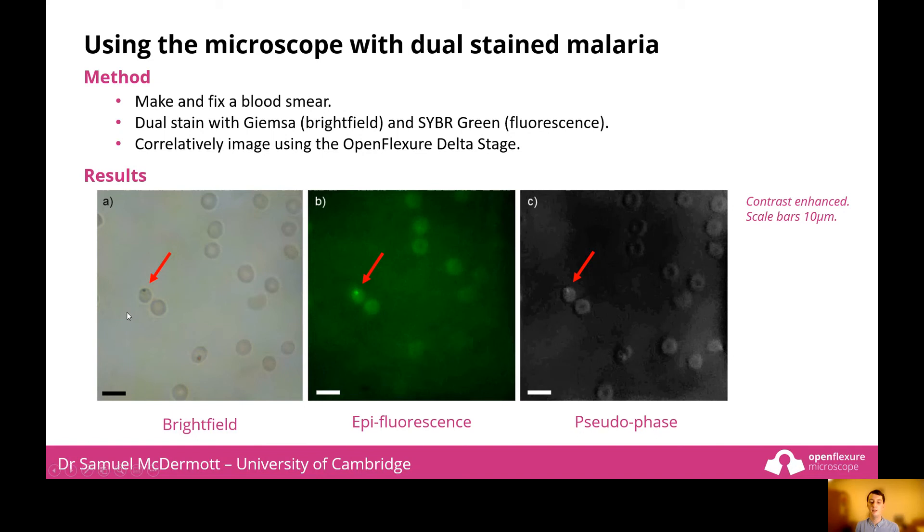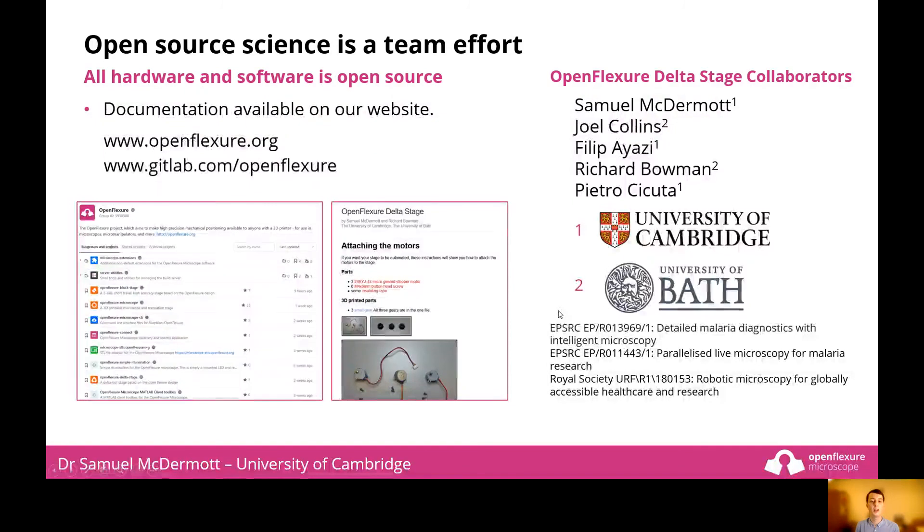B shows the same field of view but this time using epifluorescence. The SYBR Green highlights the location of the parasite a lot more clearly than the bright field image. Finally, in C, we can see the same field of view as a pseudophase image. I would encourage you to visit our website and GitLab where everything is available to look at and download. I'd like to thank my colleagues who have helped with the OpenFlexure delta stage and our funders. Thank you for listening.